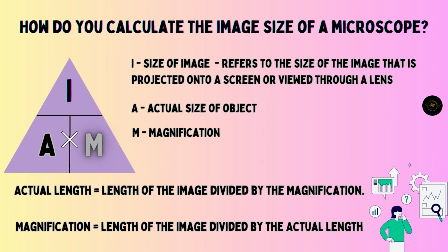So the information that you use for the microscope is that the total magnification is, let's say, 40. Then you observe under the microscope using this total magnification, and you see something. The thing that you see is bacteria. And that image that you get under the microscope, you can actually measure. You measure it, and you find that the size of the image that you observe under the microscope is 80 micrometers.